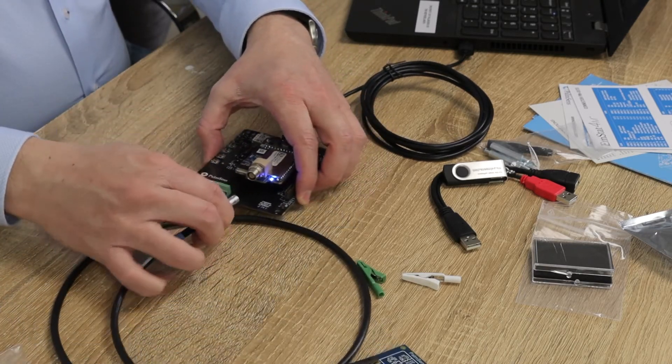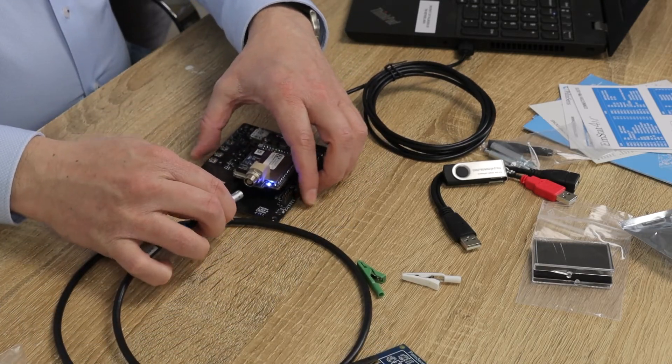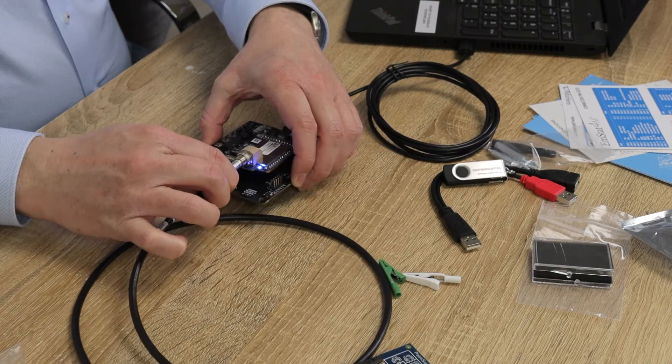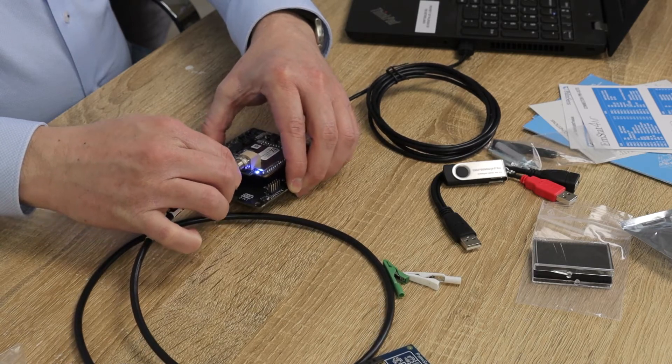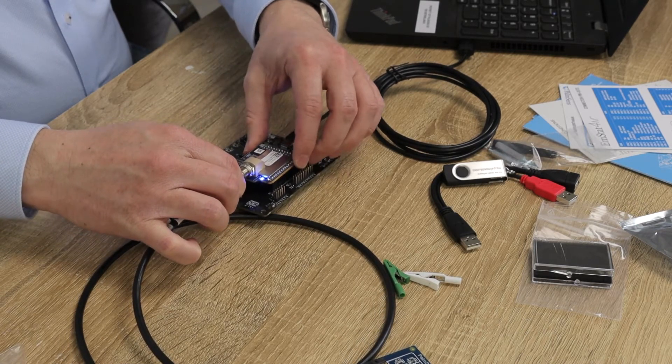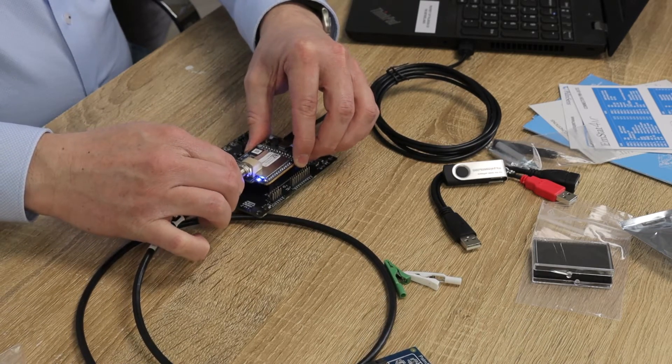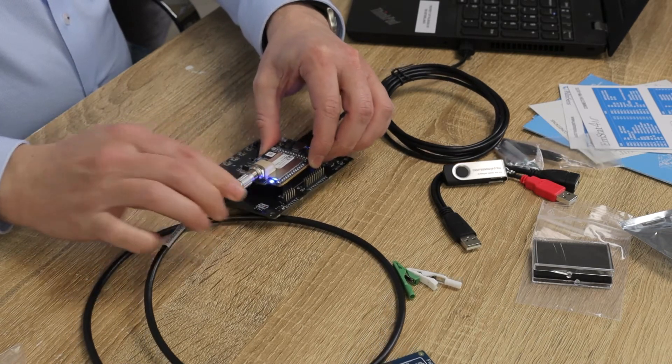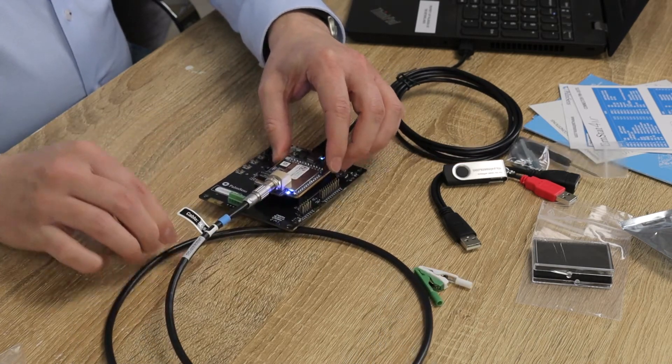Then I look for the red dot at the other end of the cable, put it up and shove it into the lemo plug. There we go.